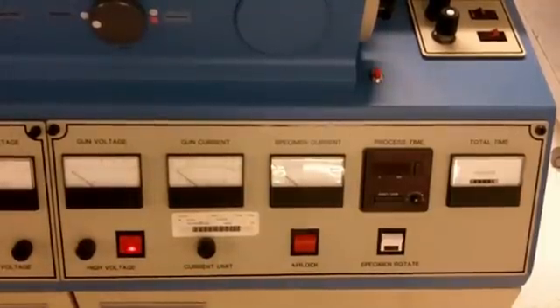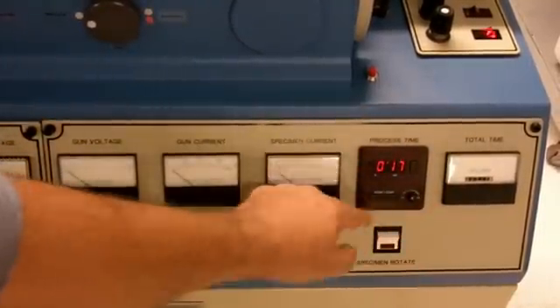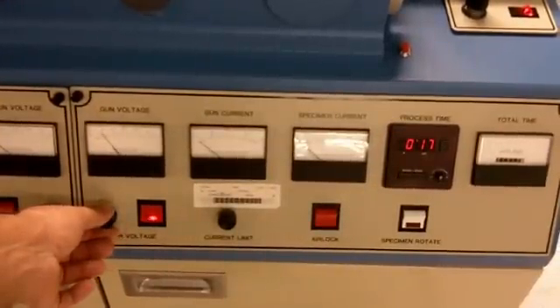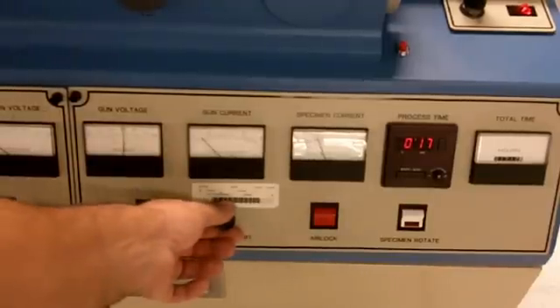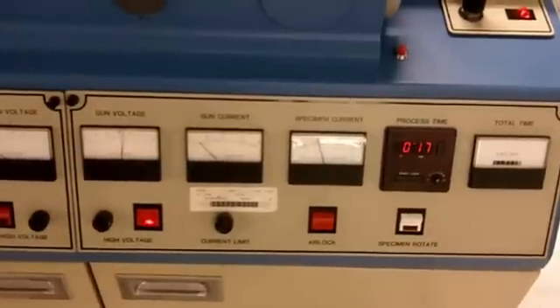Our desired setpoint is in. We can turn our dial here to increase our time. Hit start — the high-voltage is now enabled. Now, if we slowly turn up our knob, we will start to strike a plasma. Down in the sample chamber, you can see that the ion gun is, in fact, working on the sample holder.